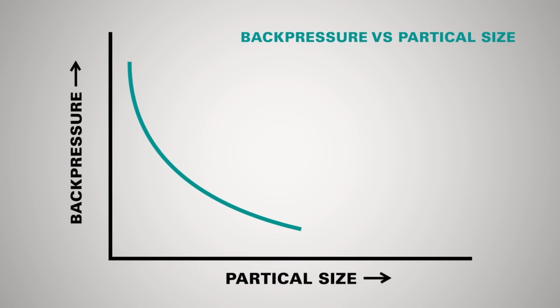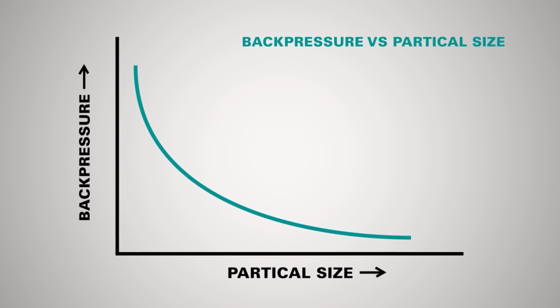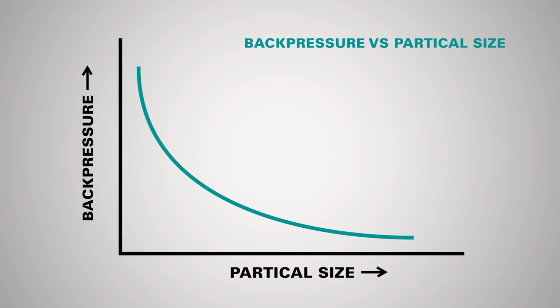But if you have too big of a particle size, sometimes you don't have good separation, sometimes your resolution is a bit less. And not only that, sometimes you can lose some of the yield and things like that as well. Now, there are pros and cons to everything. Of course, when you work with small particle size, the back pressure will increase significantly, whereas with a larger particle size, you will have less back pressure.